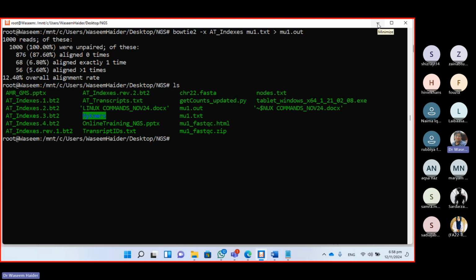But before we go into the next week, the sample I gave you, just do this QC and assembly with that and try to find out which sample was given to you. It's coming from which individual, which chromosome, which part of the genome, and what genes it carries. That's your homework. Okay. All right.